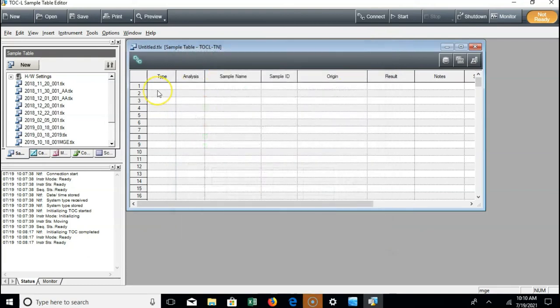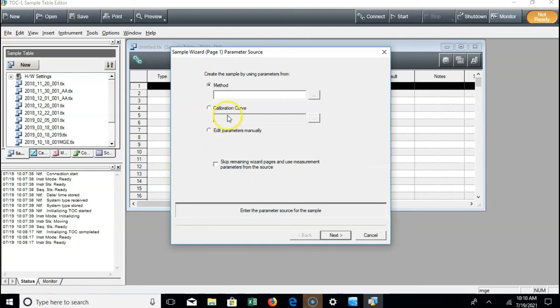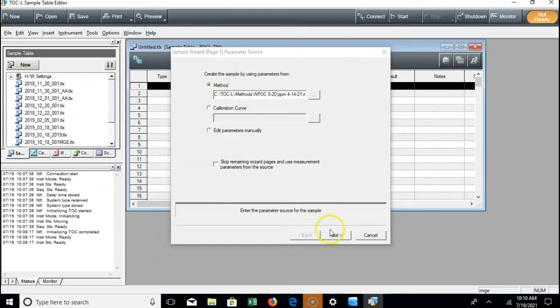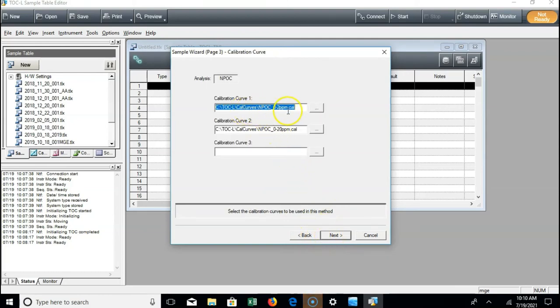While everything's warming up, we can start preparing our sample schedule. Keep in mind that whatever type of analysis you'll be running, the steps might be slightly different — you'll click on different calibration curves, systems, or analysis types. The specifics are in the standard operating procedure, so keep that near you. Right click and hit insert sample. It'll ask what method you're using — I'm going to pick NPOC because it's the most common. Then it asks for your sample name and method type. I'll call my sample DI and pick the NPOC calibration curve that corresponds to the method.